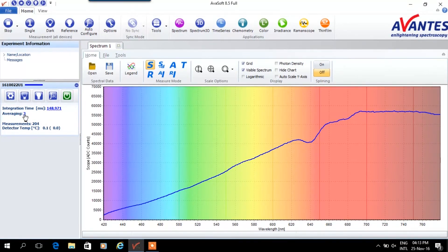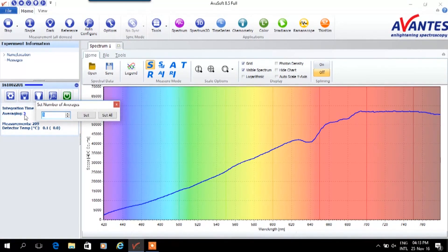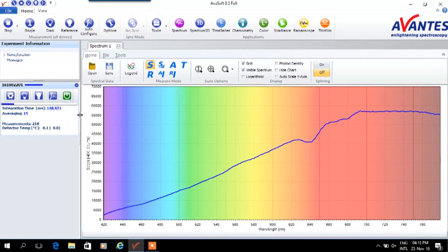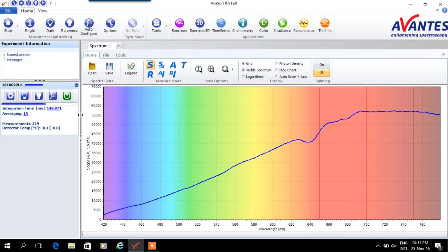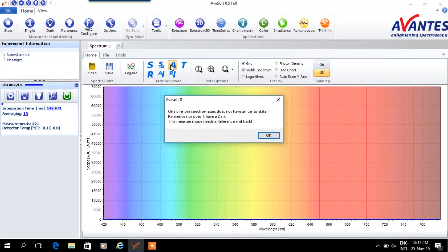We can maximize the signal by choosing the optimal integration time. A quick way to do so is using the auto-configure button. One can optimize the signal even further by increasing the averaging, which minimizes the noise.